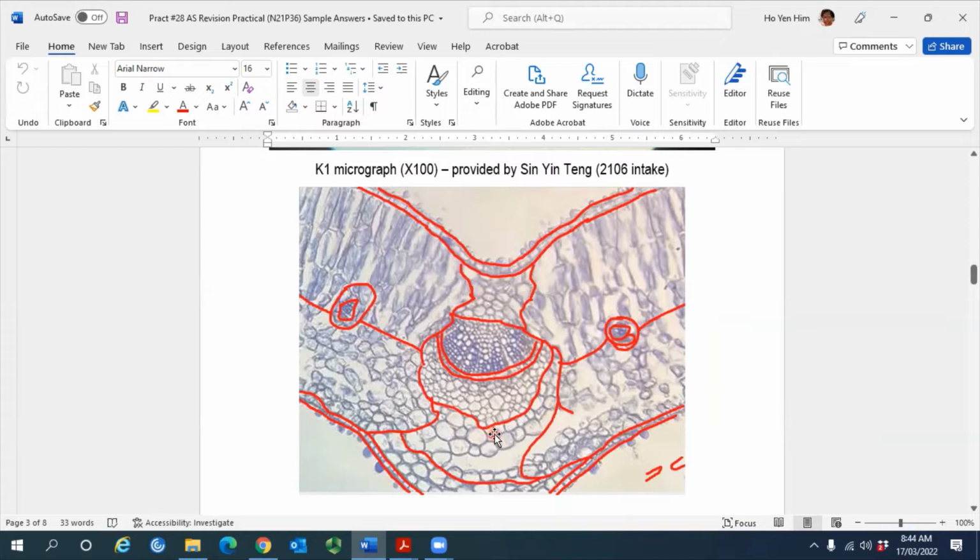So when you draw borderline, it's based on size of cell, shape of cell, color of cell, and also your theory. So make sure the reference I've given to you for the plant slides, that reference, read everything. Once you read everything, go through one time, any slides that come to you is very easy. Okay? So you need to do your homework.